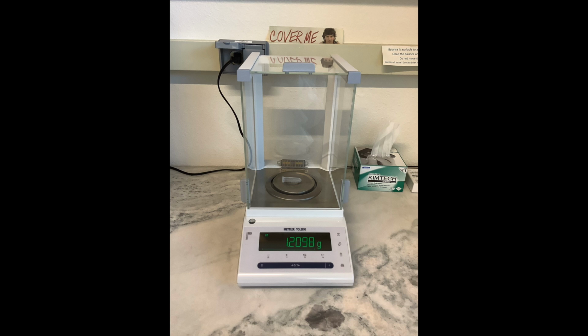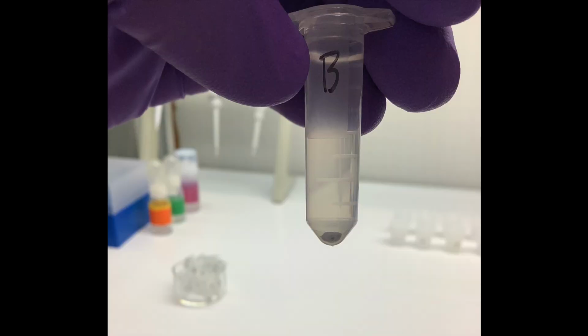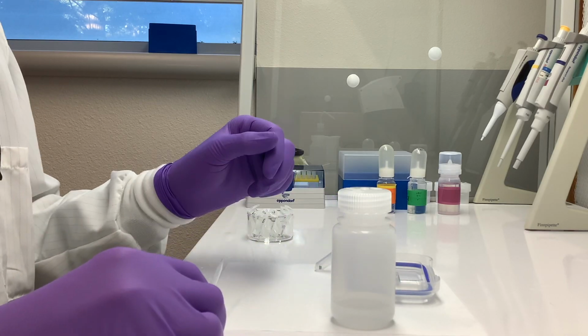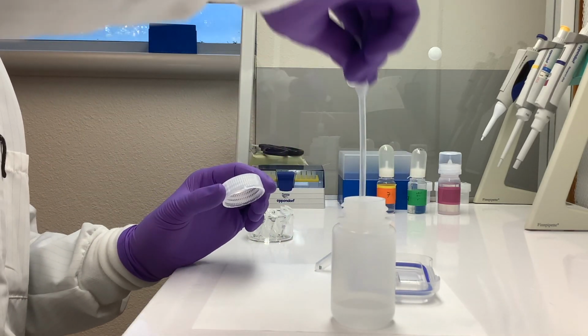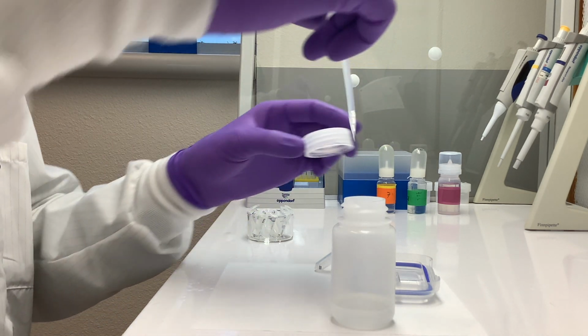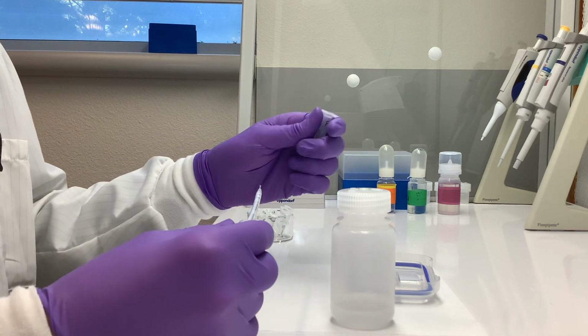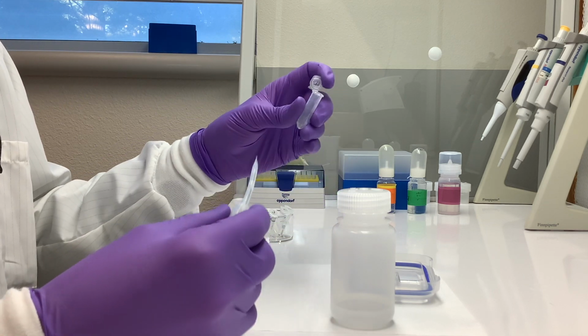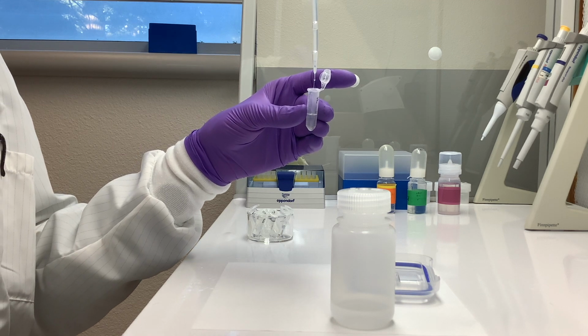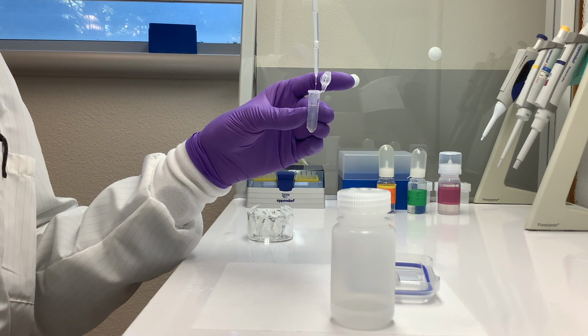After noting the mass of our sample, we then want to clean off our samples before digestion. This means removing any dust or soluble material that is not contained within the carbonate mineral matrix of our sample. Cleaning methods vary broadly depending on the type of sample, but carbonate minerals are often cleaned with an organic solvent like isopropanol, acetone, or methanol. Here, I am pipetting methanol into the vials.